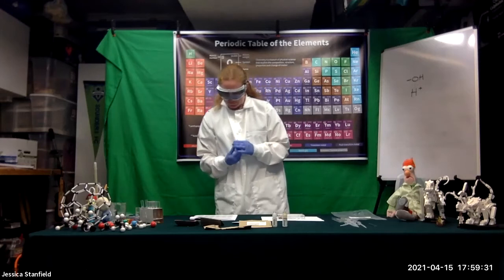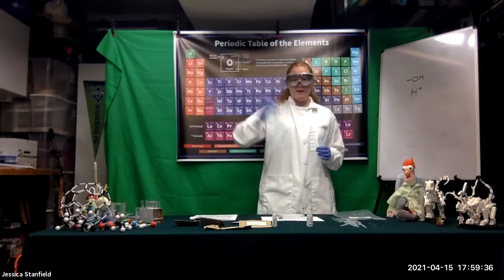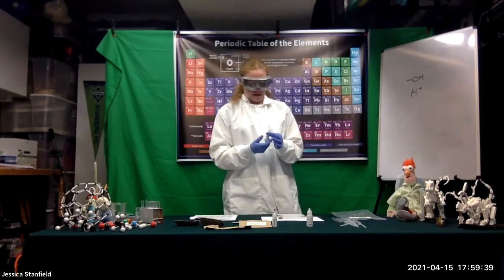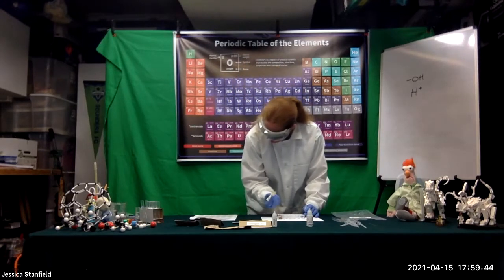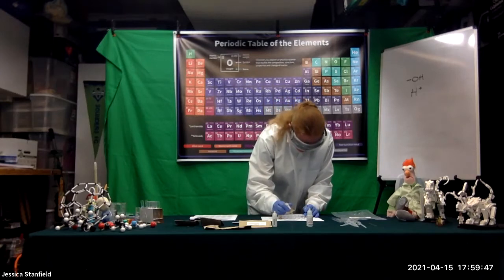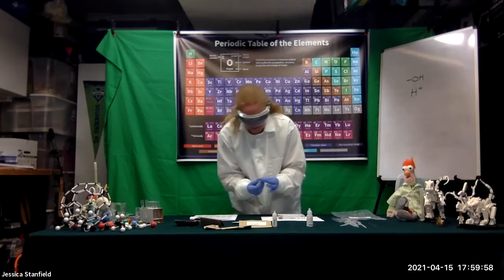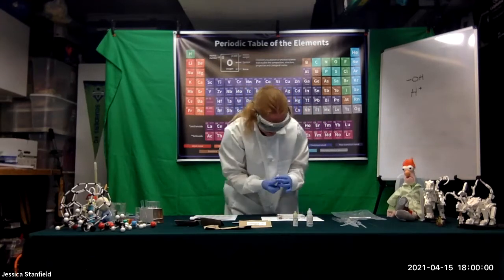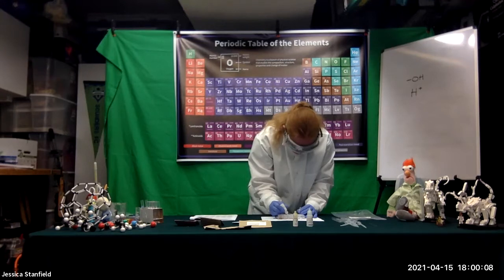Next, in well B3 I'm going to add 10 drops of the iron three chloride. We want to shake this bottle because it may be a little saturated and there might be some solid material in there. Then in well B4, I'm going to add 10 drops of the acetic acid.